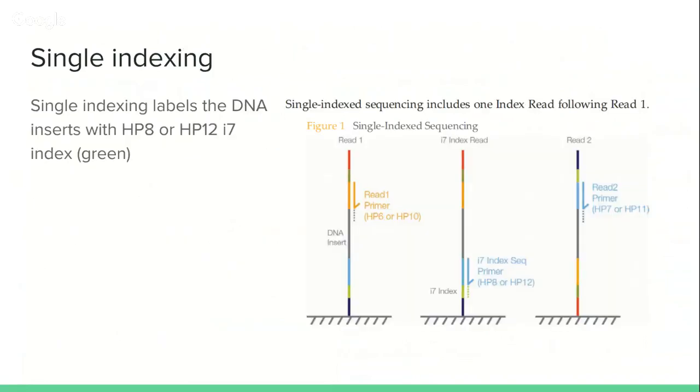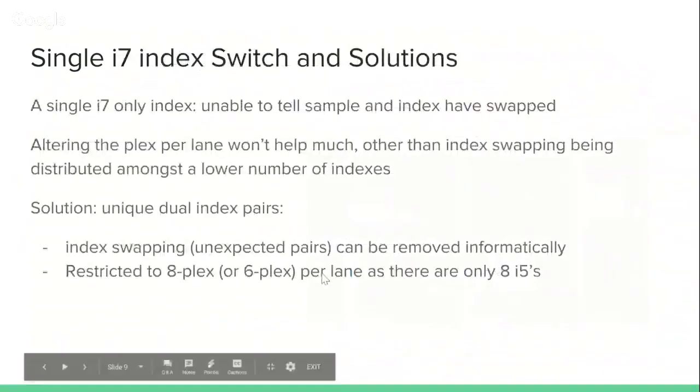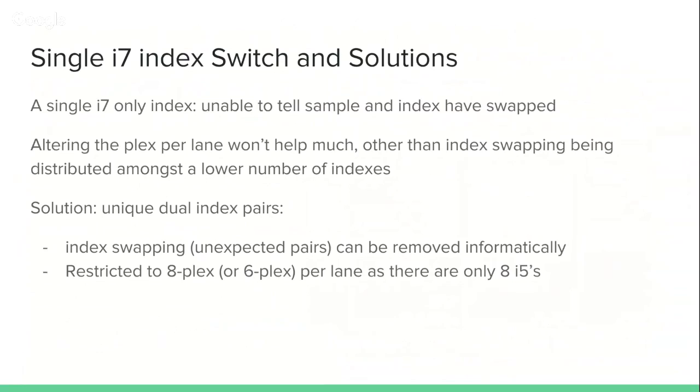And then the solution is to restrict the indexing combination so that you can find out when this error has happened twice in one single molecule rather than only once.